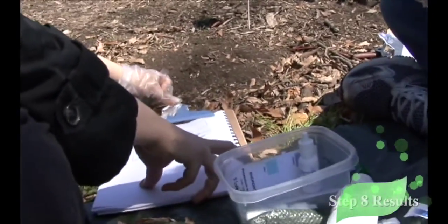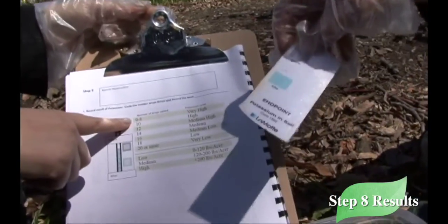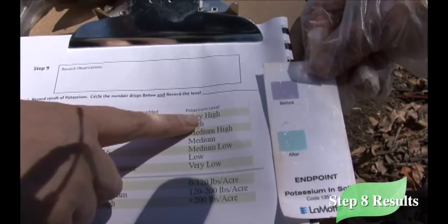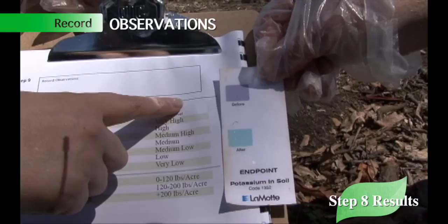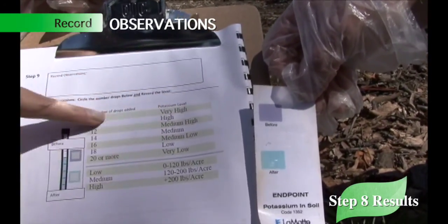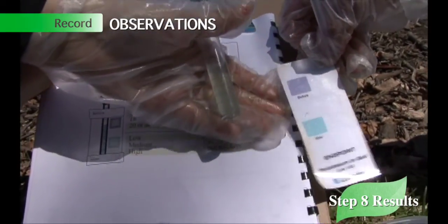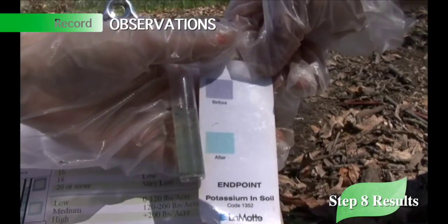And we could take a look at that to see 0 to 8 means it's very high, and we want to record that it took 8 drops, and we'll circle very high potassium level. If you notice, it's more blue than it is what? Purple. Purple.